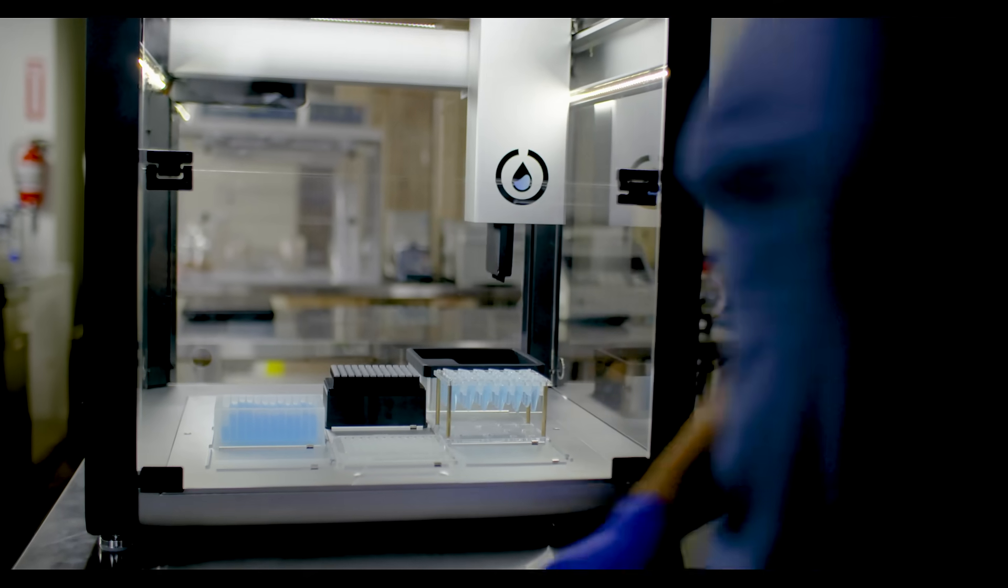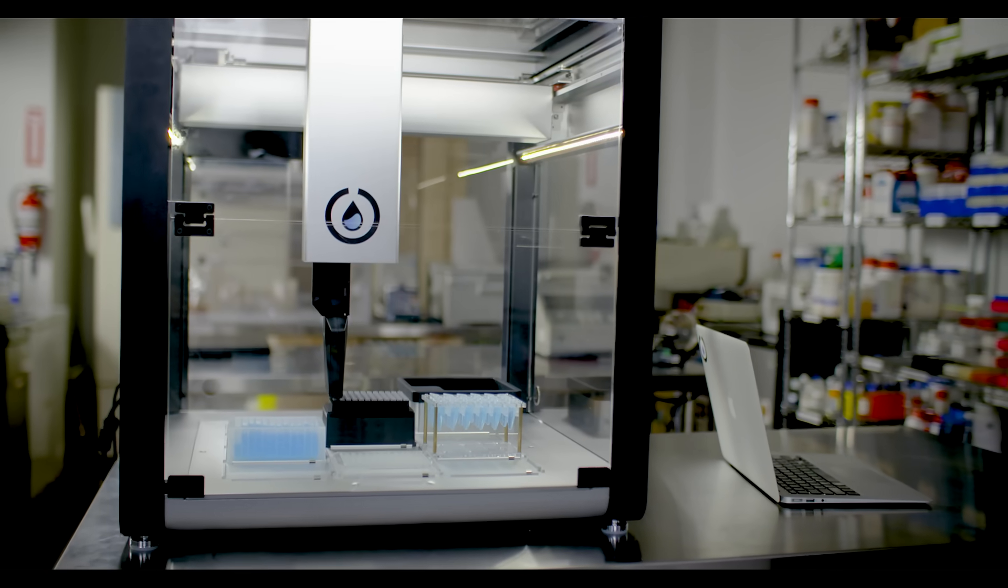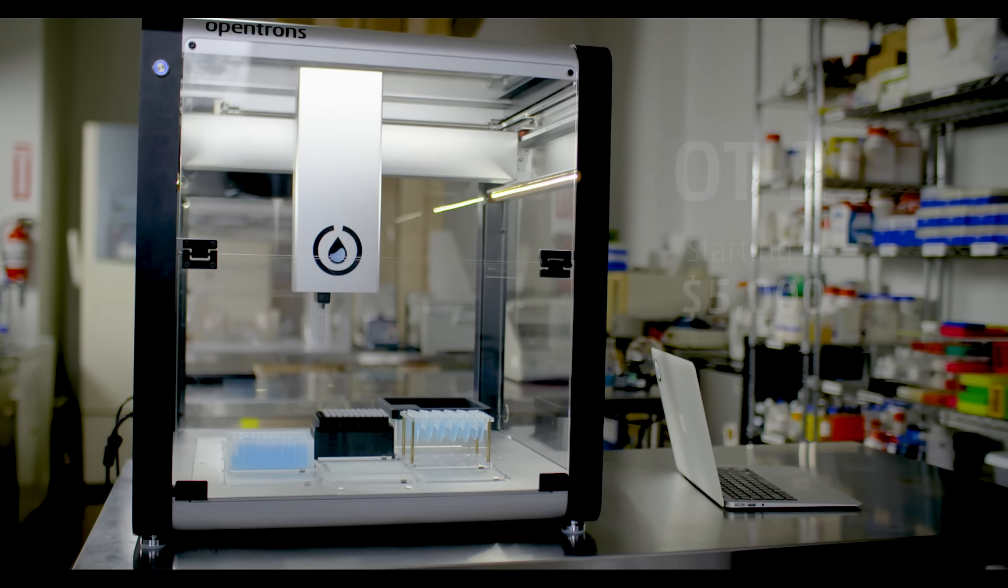You've got plenty of work to do. Why not let Opentrons handle some of it for you? Get an OT2 pipetting robot for your lab.